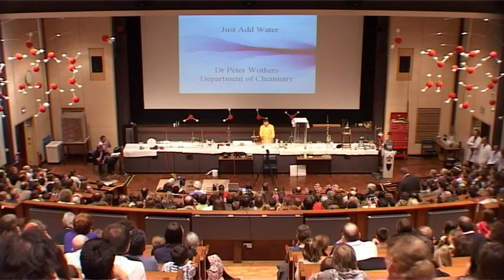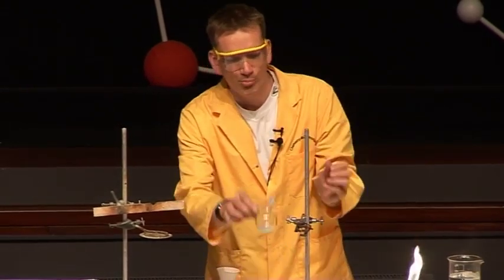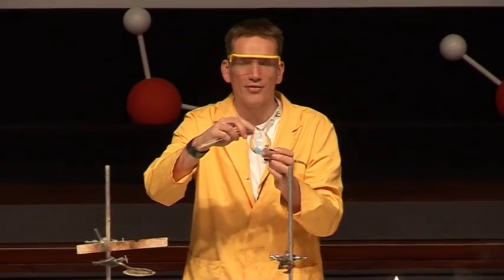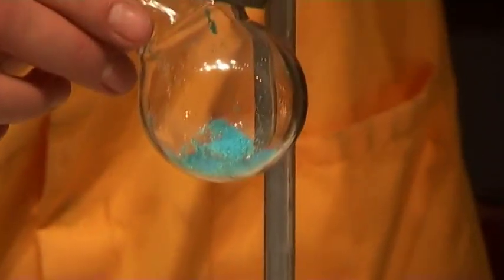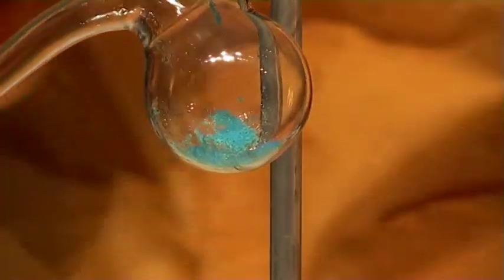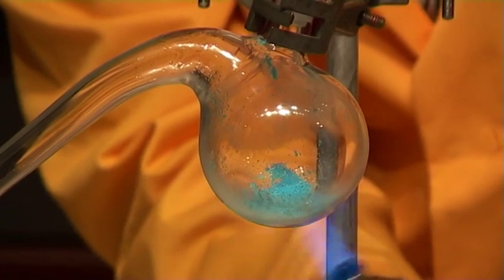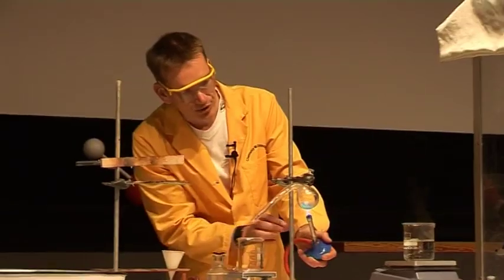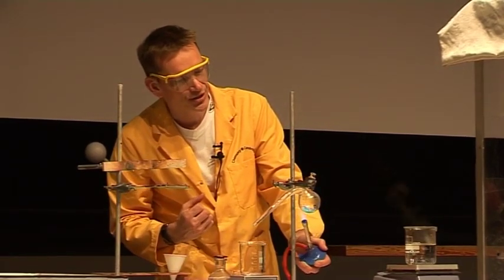I'm going to start off with these crystals here of copper sulfate. Now these are a beautiful blue colour, and this is because of the interaction of the water that they contain with the copper ions. And just by heating the crystals we can actually drive out the water. So I'm using the Bunsen here to heat up the crystals and drive out the water that's locked up in them, and we should see a colour change.